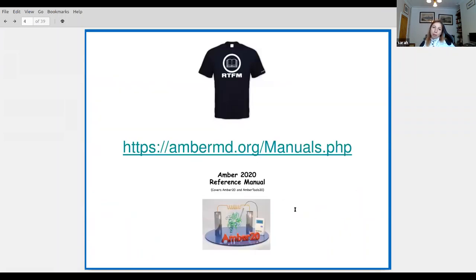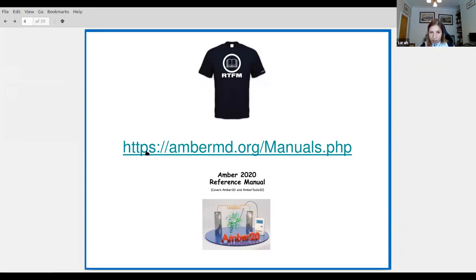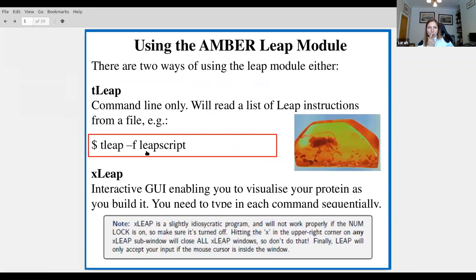The reference manual is now AMBER 20, covering AMBER 20 and AmberTools. There's an awful lot to read, but it's very comprehensive and actually quite usable. During the demonstration, we're going to concentrate on the antechamber and LEAP modules.